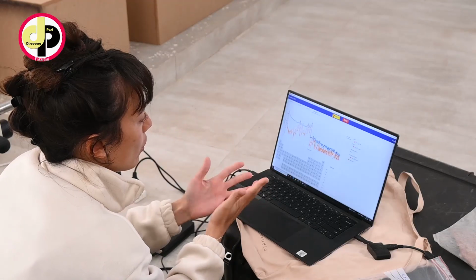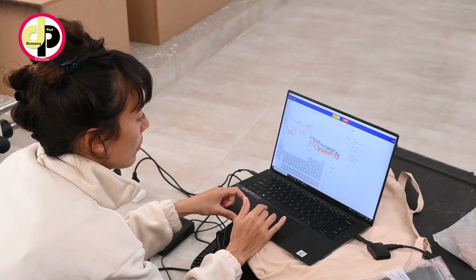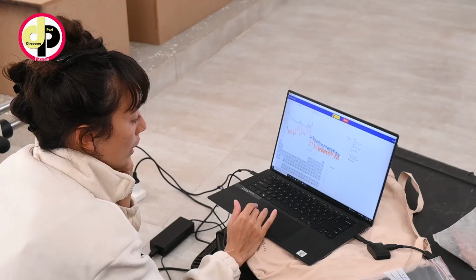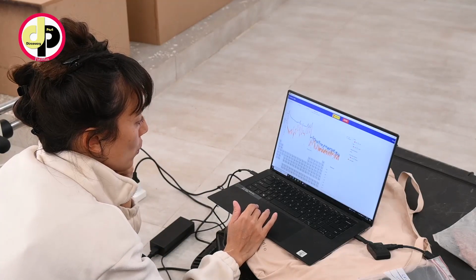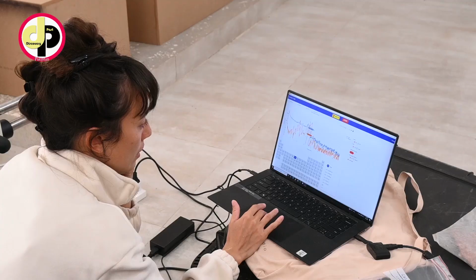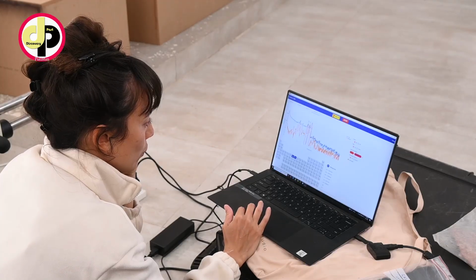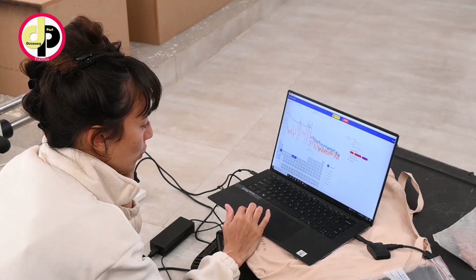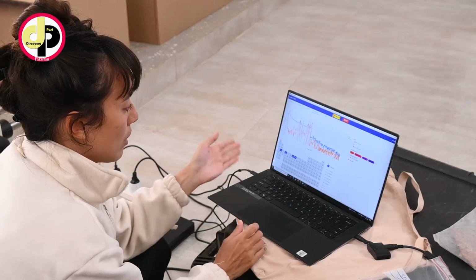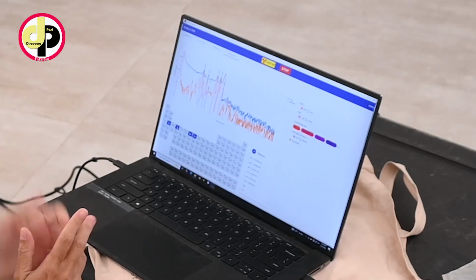One spectrum from X-ray fluorescence spectroscopy, which is here. And thanks to that, we see some peaks, and we will look at the elements present inside. So for example, we can look for the iron, and indeed it's checking with this, the manganese, the calcium, and maybe also titanium. So thanks to this database, we can directly know what kind of atoms are in this pigment.